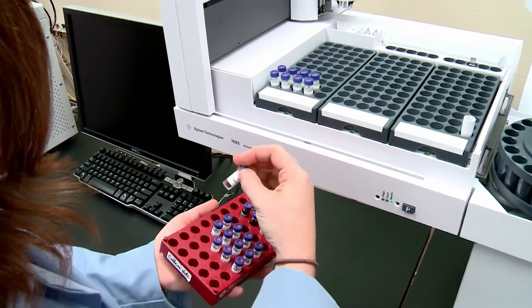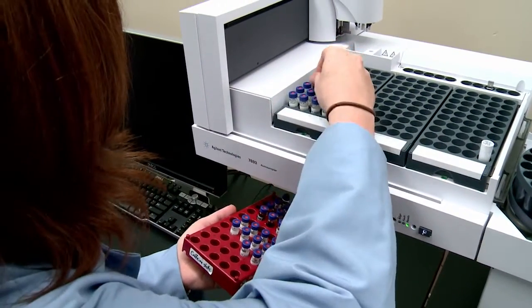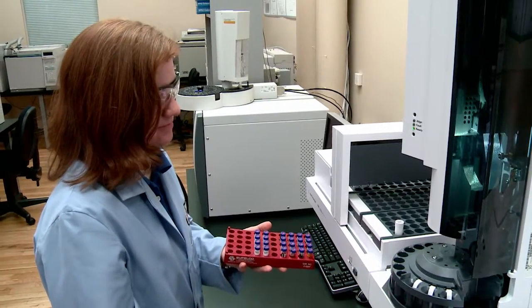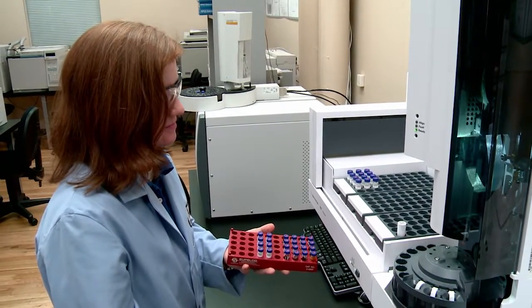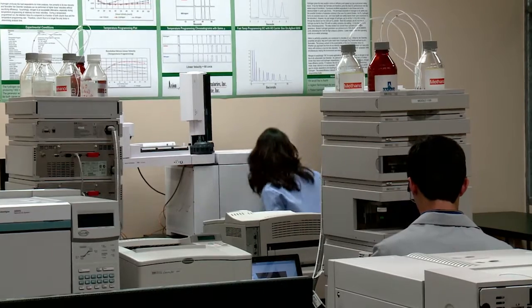But to me, one of the things that has changed over the years is the level of experience of the operator. The typical GC operator today is not necessarily a trained chromatographer, probably not even a degree in chemistry or biology or even science at all. These are working folks who need to use this tool in order to generate a valid result. So I'm here to unveil those mysteries to try and get people to understand the working knowledge of GC.